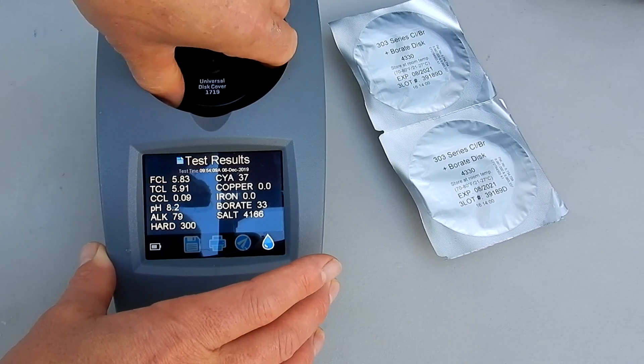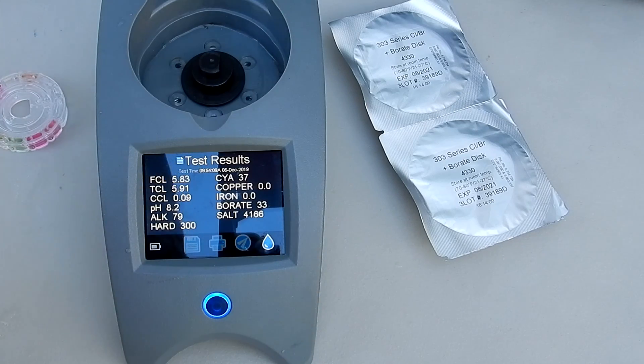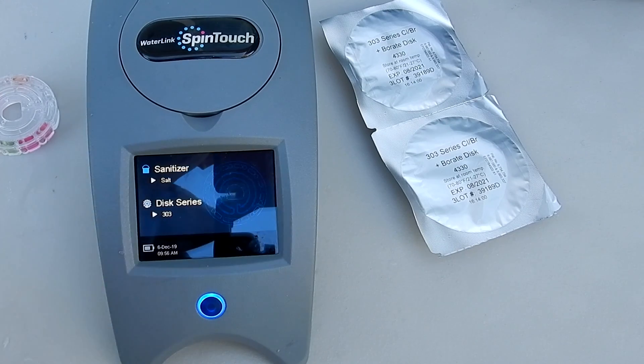I'm going to run the test again with the same sample water to see how the results compare. I have the second disc in, same water sample. I'll run the test again.